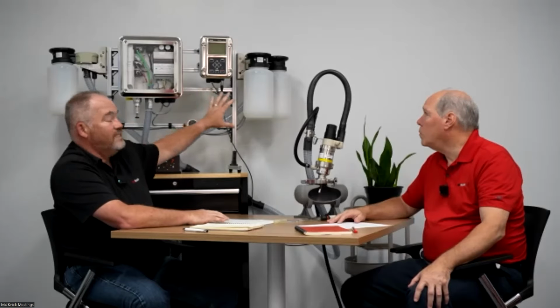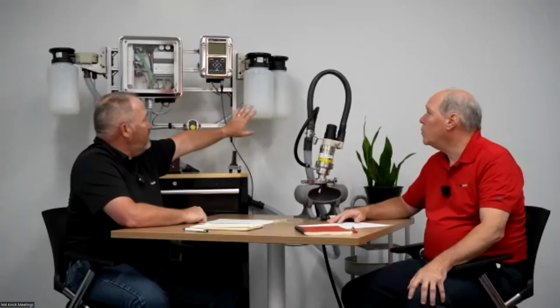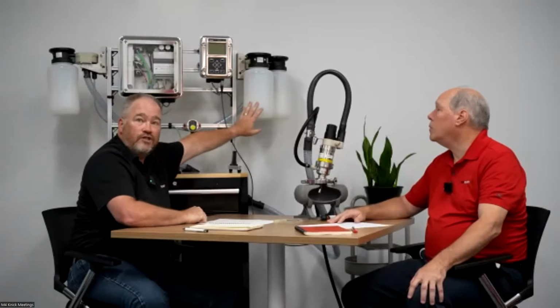Something I wanted to point out, from a maintenance standpoint, automated systems maintain the pH probe, as we've already established, through either calibration and cleaning, but there's still maintenance required with the automated system itself, and that would be refilling calibration solutions and detergents and things like that.